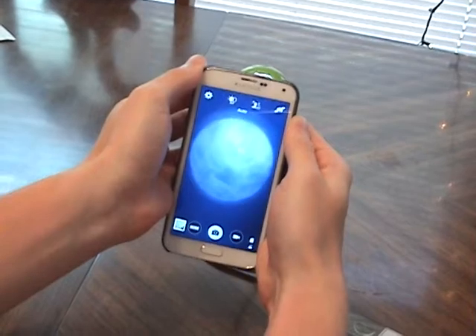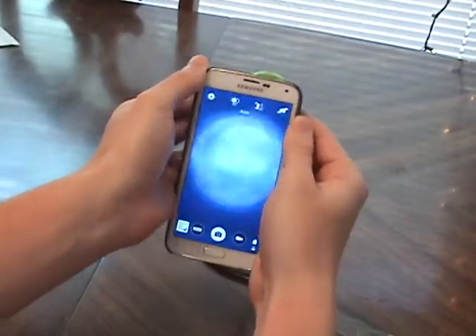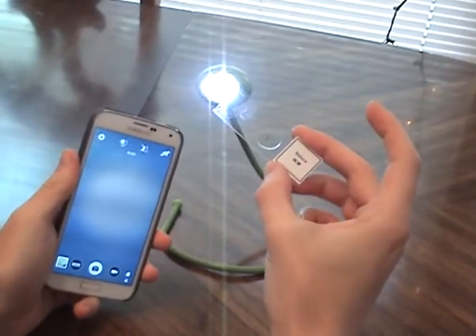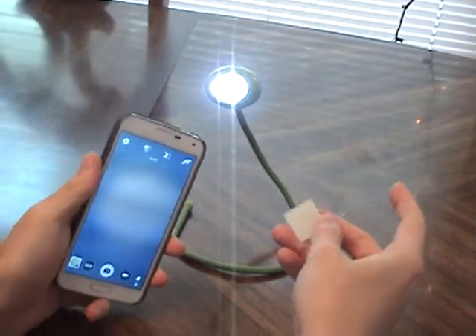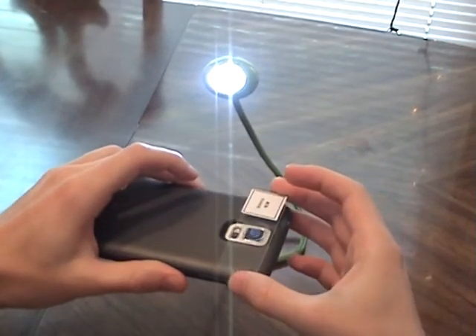So you press on. Then take your microscope slide. So what we're going to look at right now is Volvox, which will be included with all the slide rewards. So you want to get it approximately lined up before you start.